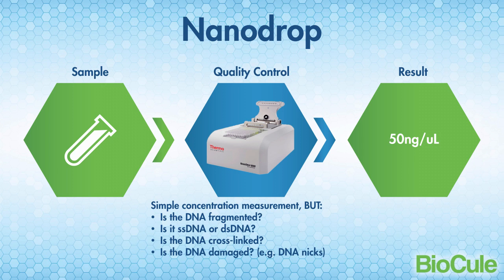NanoDrop is one of the most widely used QC instruments. However, it's actually more of a quantity control rather than a quality control instrument. People use it to find out how much DNA they have in a sample, but it doesn't tell them anything about the quality of the sample, nothing about the level of fragmentation, amount of single-stranded versus double-stranded DNA, or the level of cross-linking. This often leads to an artificially high estimate of the amount of functional DNA in a sample.